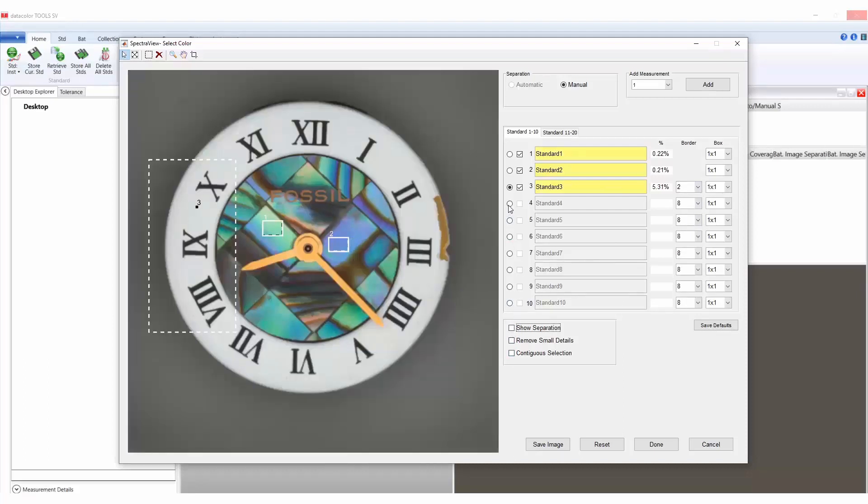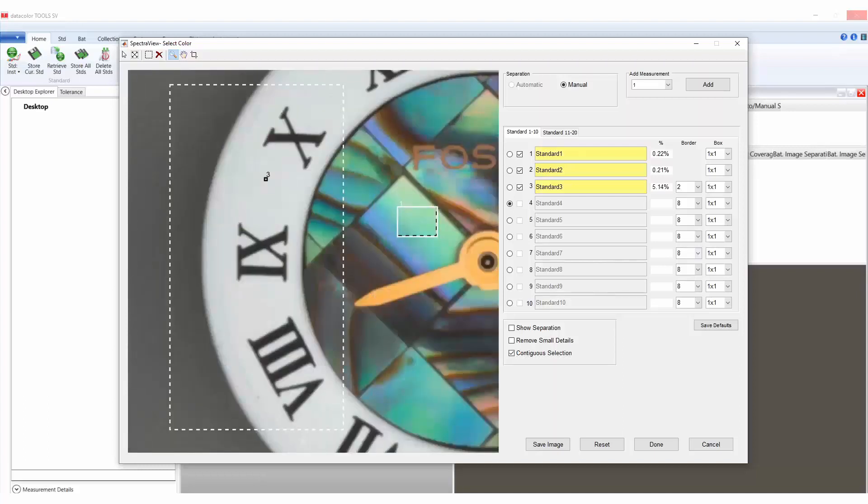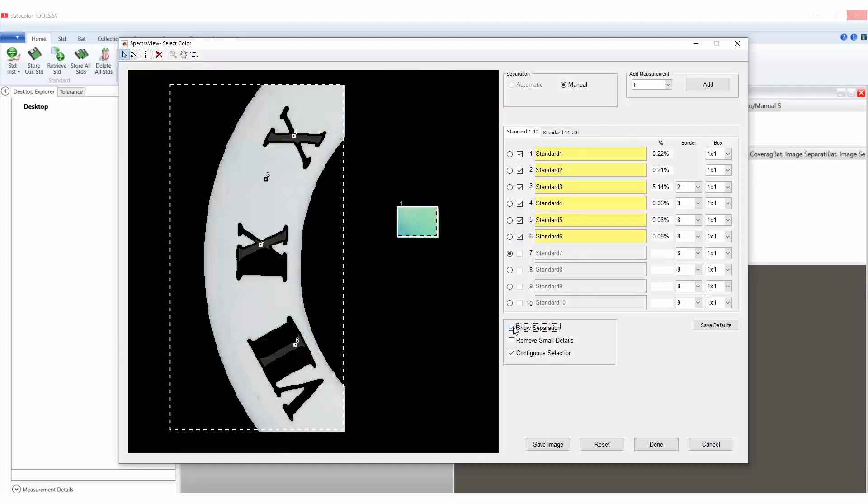Next, select the contiguous selection checkbox to begin your selections within the black lettering. Select the zoom icon on top of the color measurement window, which looks like a magnifying glass, and zoom in to allow a clear view of the areas of selection. Choose the select colors icon to begin your color selection. When the contiguous selection is checked, it will let the user select one area at a time of the same color. Once all areas of the black letters have been selected, update the border from the default of border 8 to border 2. If the user would like to review the border selection or changes, they would again select show separation. The remaining selection will be done using the select colors icon with the standard separation method.